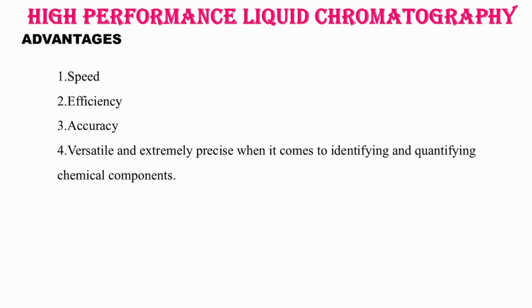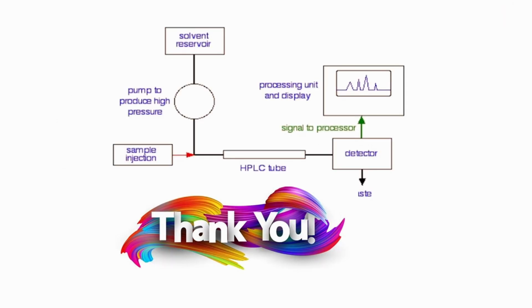Below are the advantages of using HPLC: speed, efficiency, accuracy, versatility, and being extremely precise when it comes to identifying and quantifying chemical components. Hope in this video you learnt about HPLC.